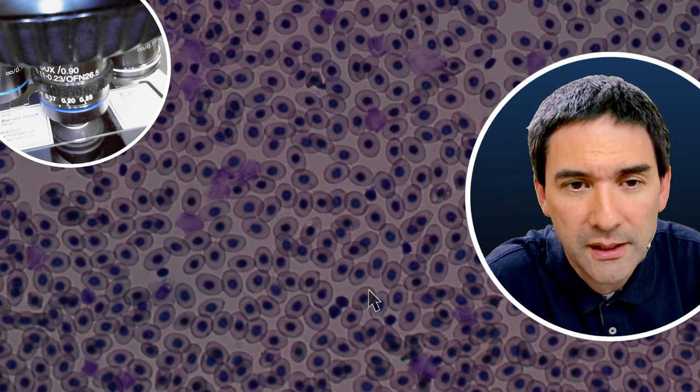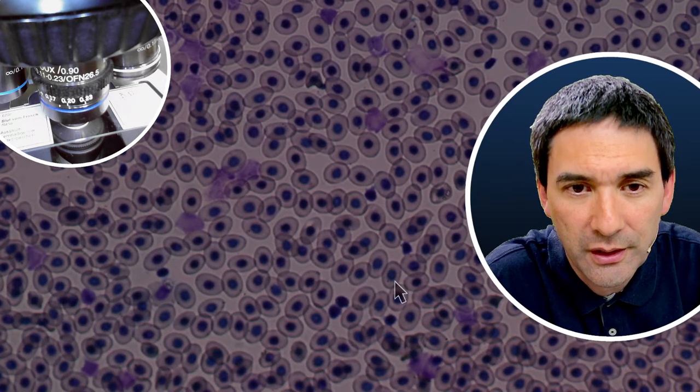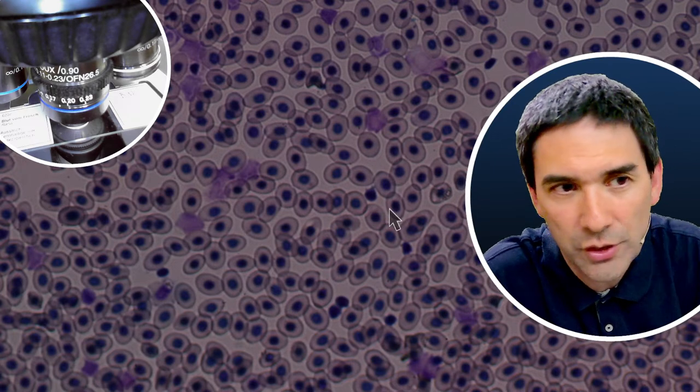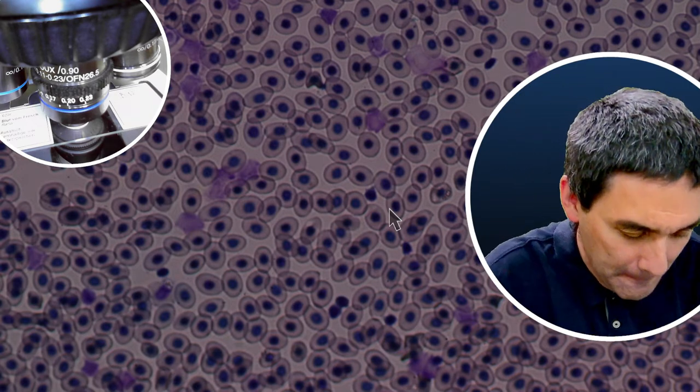The red blood cells of mammals, including humans, obviously do not have a nucleus. Red blood cells are packed full with hemoglobin, and they have lost the nucleus during development. And in frogs and other amphibians, the red blood cells have a nucleus. Just so, because we were just talking about blood. Okay. So let's move on.